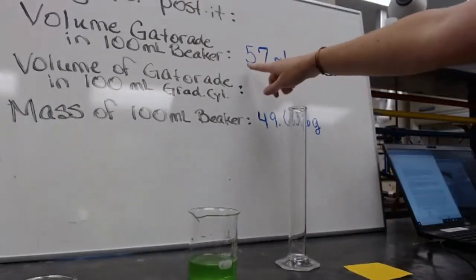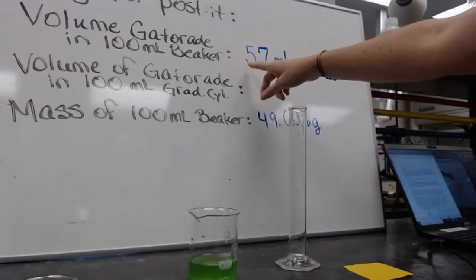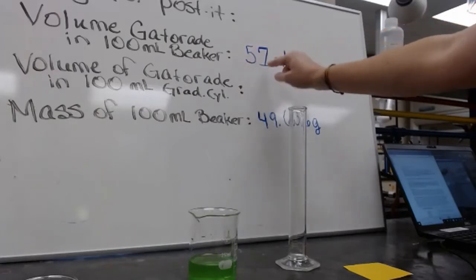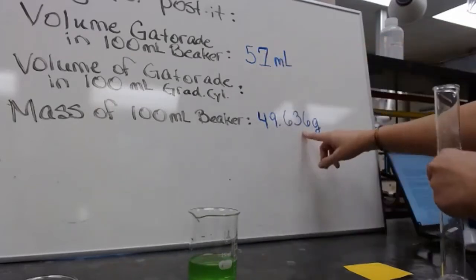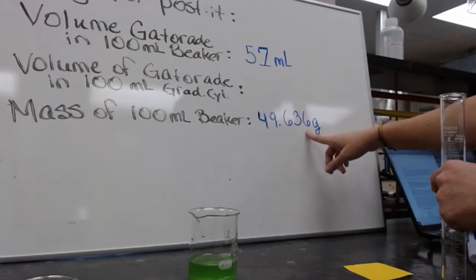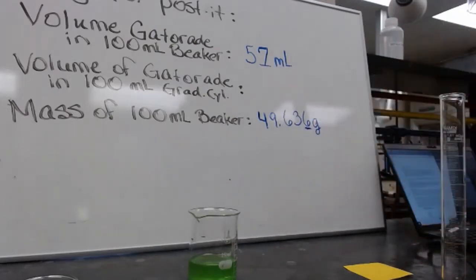This is a measurement. These are significant figures, which gives me the value of my measurement. Significant figures are composed of all of the known information, which on line devices are the lines, followed by one estimated digit where you physically estimate, versus a balance, which estimated for you, you just had to correctly write down what you saw. The last digit on any measurement is the digit that is estimated.